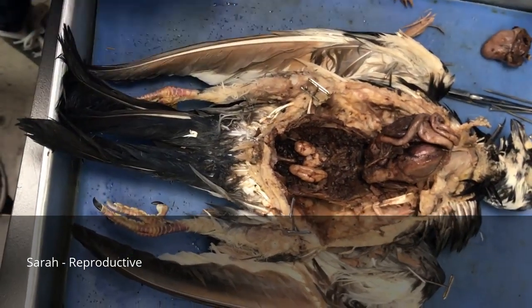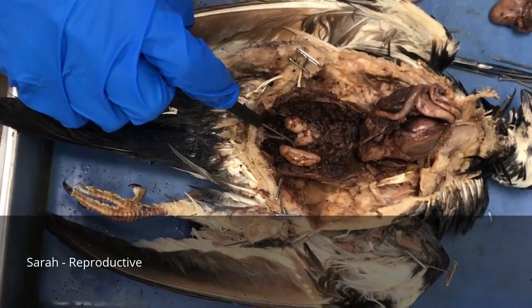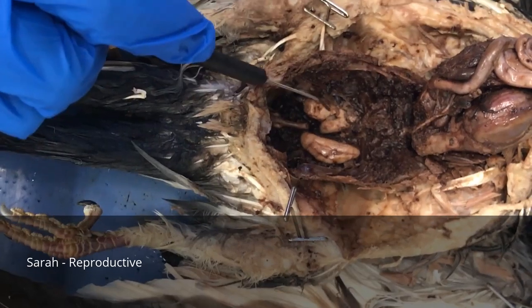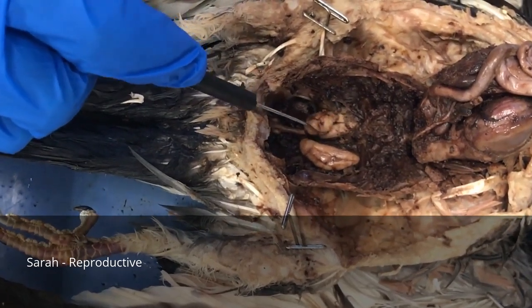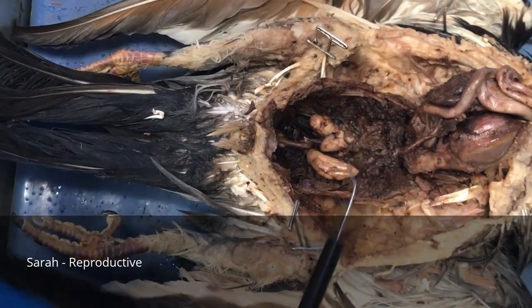Alright, now I'm going to talk about the reproductive organs of the pigeon. This is obviously a male because we have two testes here. The testes are small relative to their body size because this is an adaptation that allows them to fly better, because being smaller makes them lighter.